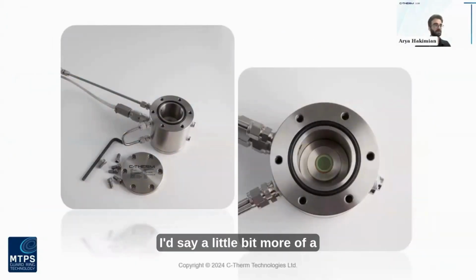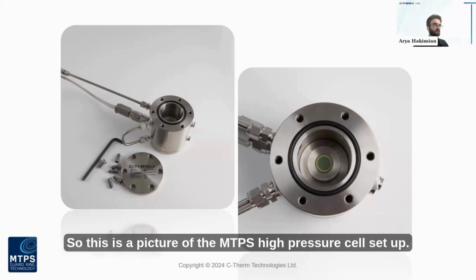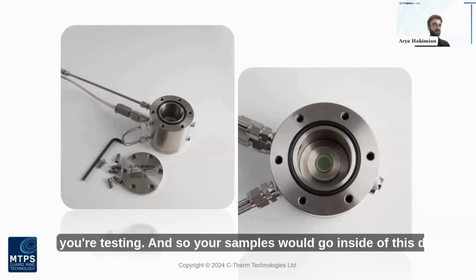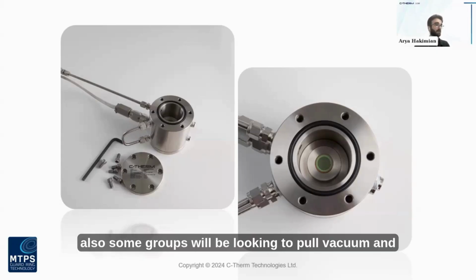A little bit more of a novel application of the MTPS is the use of the high pressure cell. This is a picture of the MTPS high pressure cell setup. With this configuration, you're able to control the pressure of the environment that you're testing in. Your samples would go inside of this device. You can subject them to different gases, whether it's nitrogen or argon. Also, some groups will be looking to pull vacuum and do some testing in those types of conditions as well.